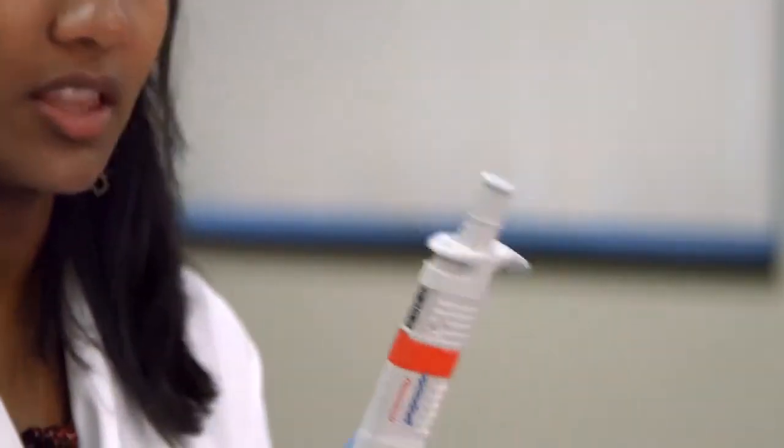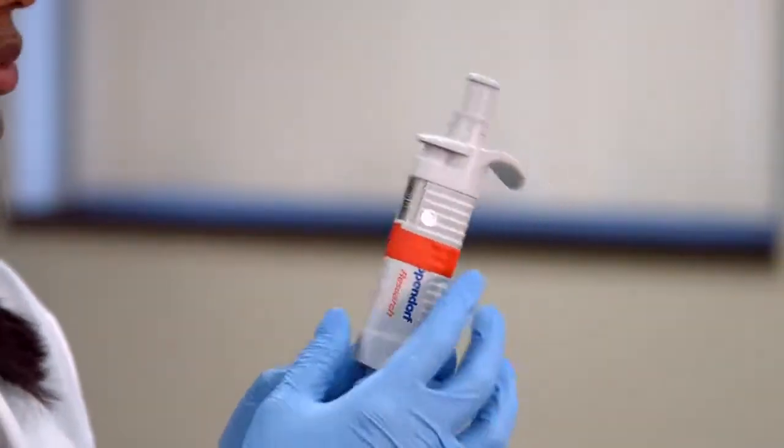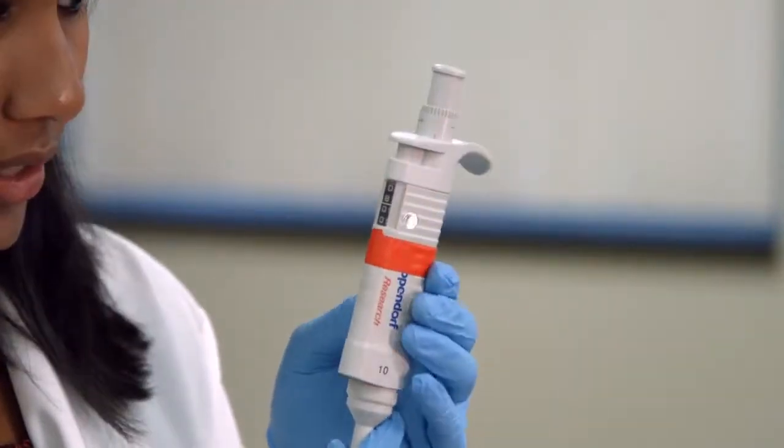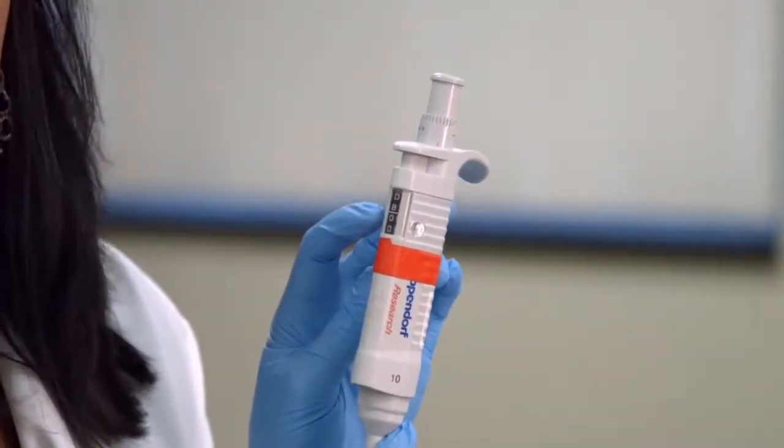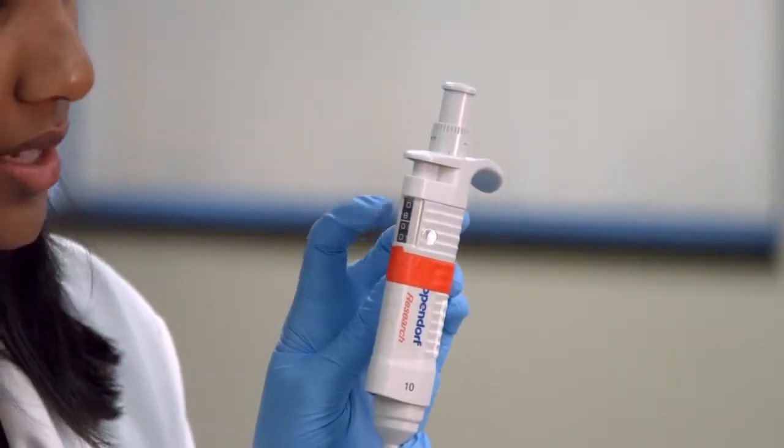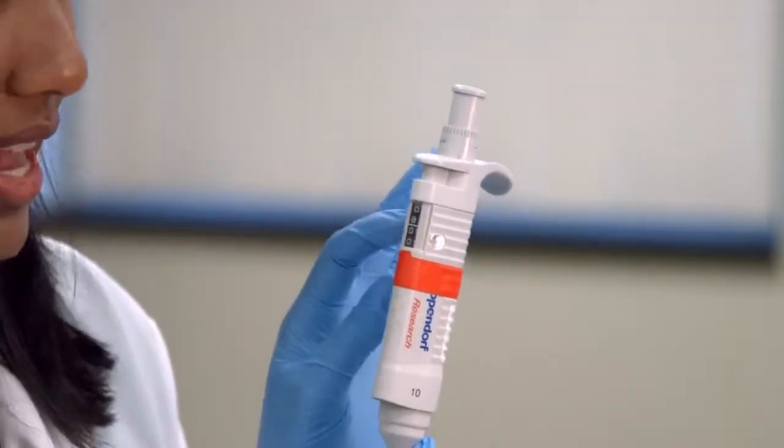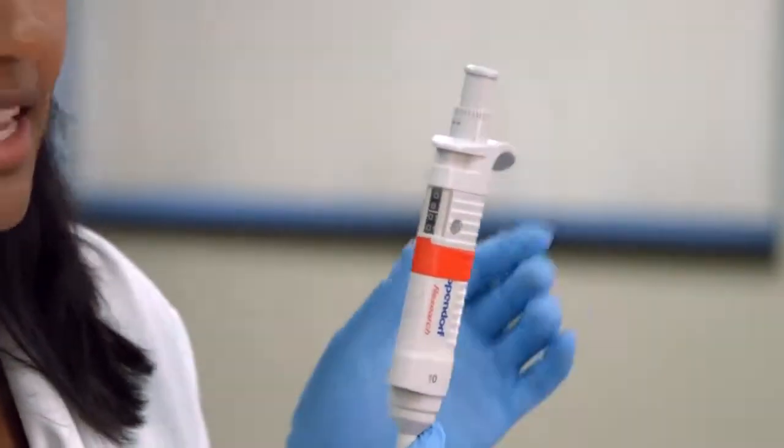And then on here, on the P10, this is what 8 microliters looks like. So yes, again, it looks like it's 800, but here the decimal point goes up to 2. So this is 8.00. Again, that line is indicating the decimal point.